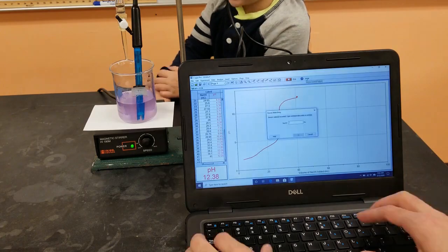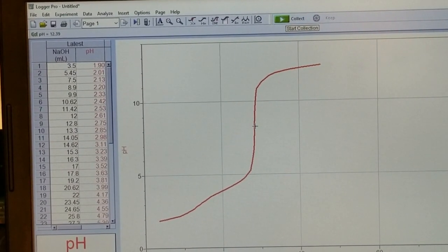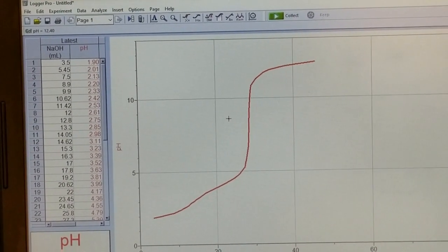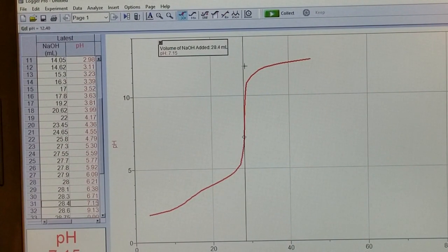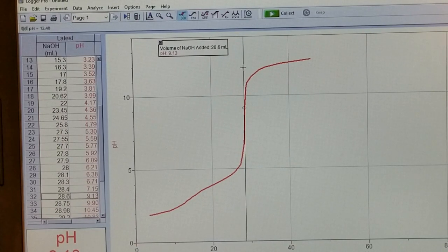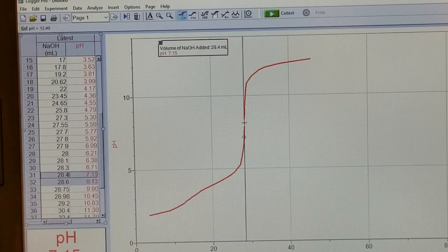And so the way to analyze this graph, because we didn't use an indicator for the purpose of doing this titration, we used the indicator just kind of as some nice observations. The way that you do this is you're going to examine and find that midpoint of that steep slope. And it looks like it was between 28.4 and 28.6 milliliters of base added, so we can call it 28.5 milliliters of base for our calculations.